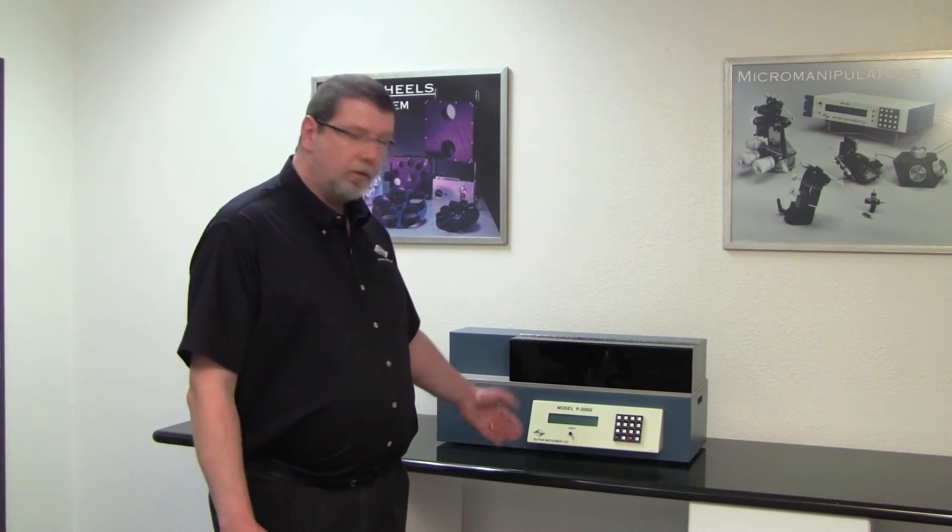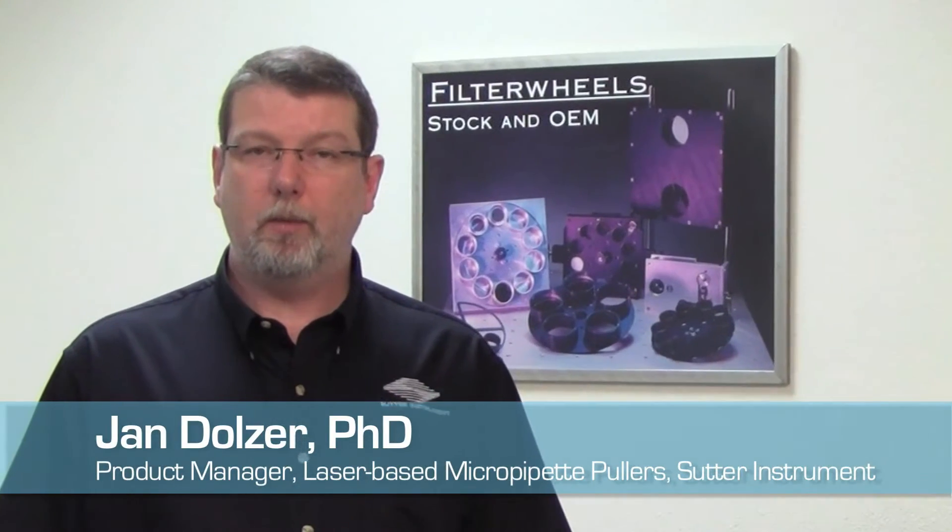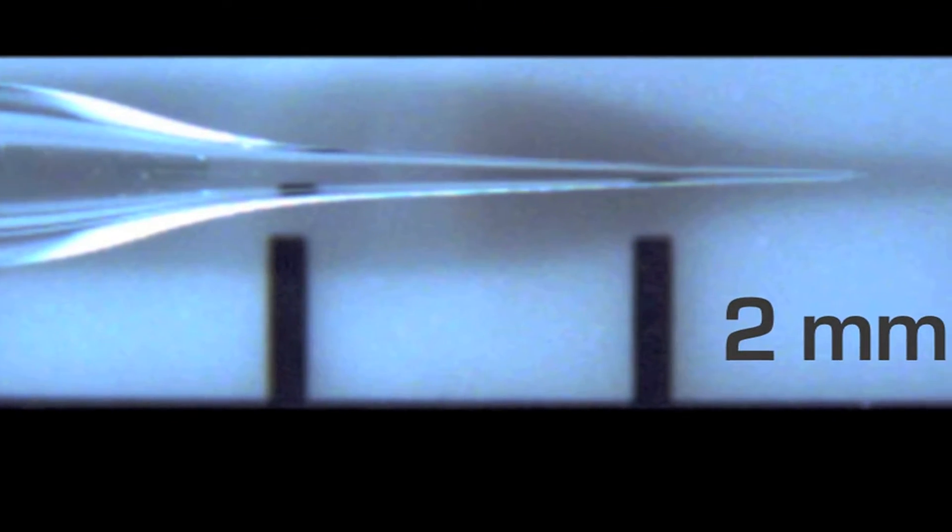Hello, I'm Jan Dolzer, product manager for the Sutter Instrument P2000 laser-based micro-pipette puller. We are producing a series of instructional videos that demonstrate how individual parameters of the pull program impact the shape of the final pipette.